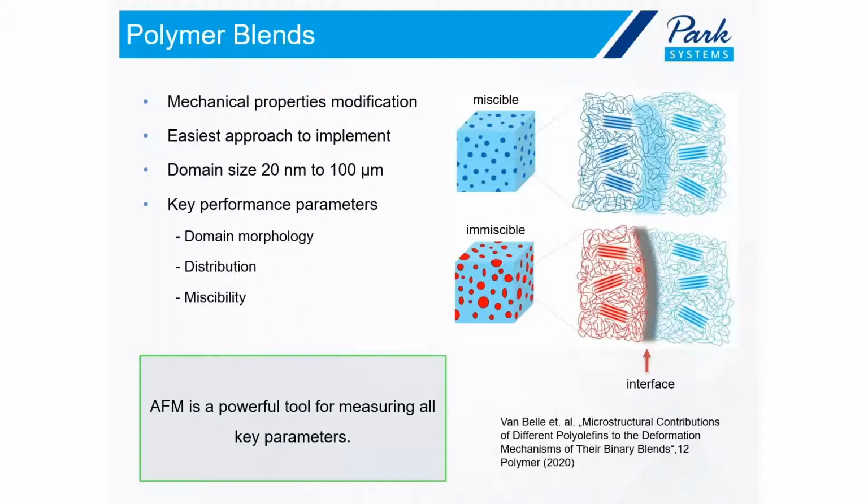Building on the example that I gave you earlier, if we are designing a polymer blend, which is a high impact resistant material, we can use polystyrene and add a butadiene rubber to it. But if the interface is sharp between the domains of butadiene and polystyrene, this interface is where the polymer starts to rupture. This is where the failure of a mechanical part starts.